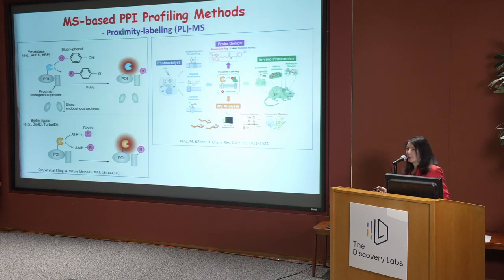These approaches have been shown in different organisms and can be used for in vivo protein-protein interaction mapping. It has also been shown to map weak and transient interactions.